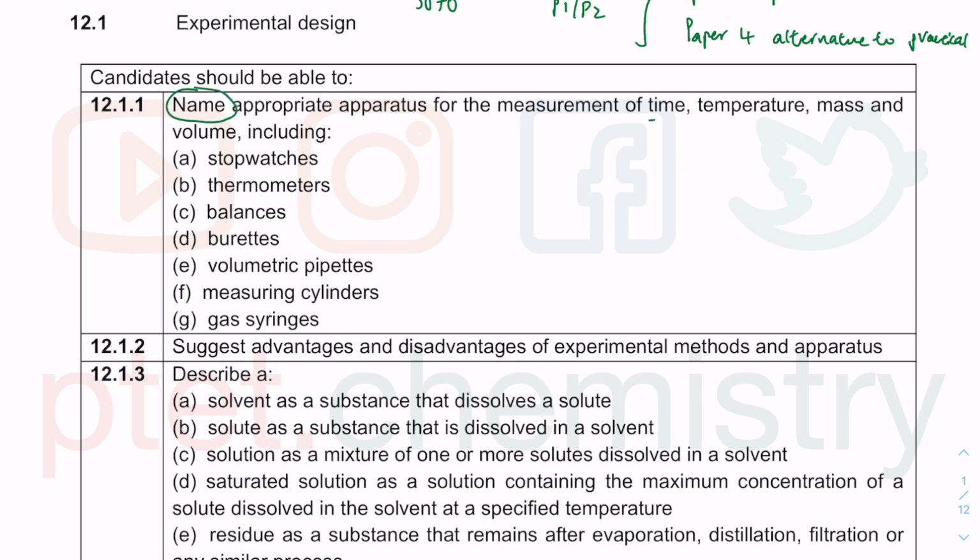We are going to measure time. So we need something called a stopwatch or stop clock. The important thing about a stopwatch rather than using the hand clock on the wall is that these are more precise. Precise meaning more accurate, as they can measure up to the nearest seconds and so on. And yes, you will have pressed one of these before.